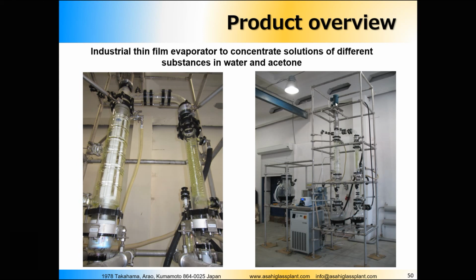Either we need a stair, or we talked about that with Shingo, and we have this, I don't know how to call it properly, this kind of flexible rod or flexible coupling, and a little knob here, and so it transfers the rotation from here straight to the drive, and so we have the knob in a comfortable position for the operation. So that was a small but very important point.